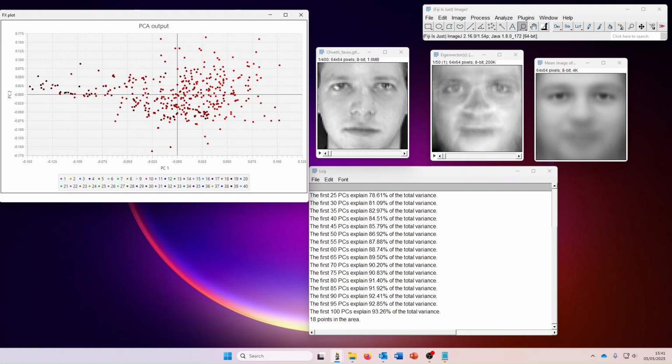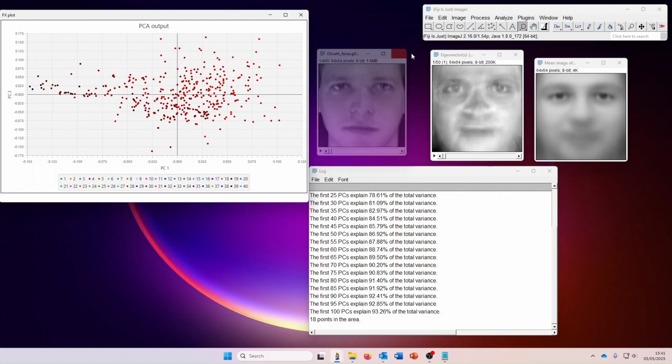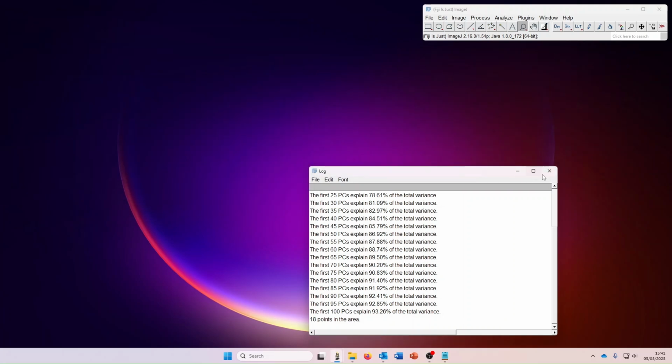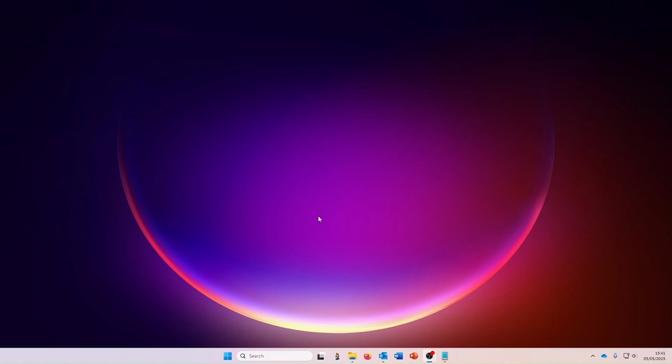So that's showing you some of the main features of version 1.06. However, I'll show you a different data set now, just to show you that it's robust, and maybe also employ a different tool than PCA. Oh, I probably didn't have to close the Fiji there, so I'll just reopen it.